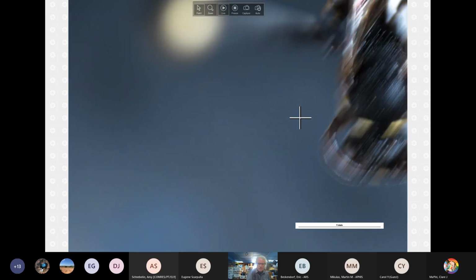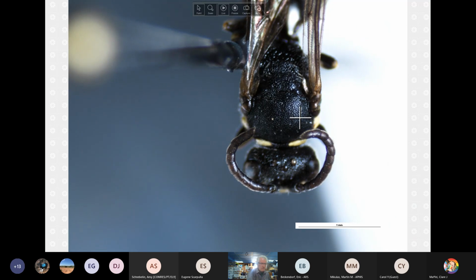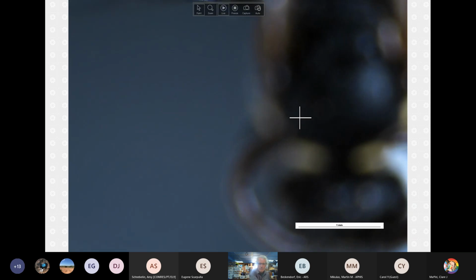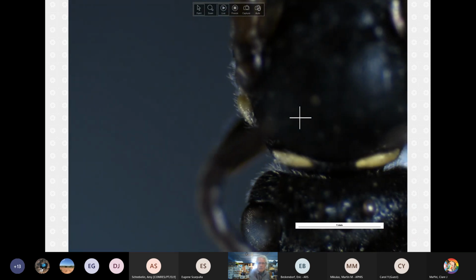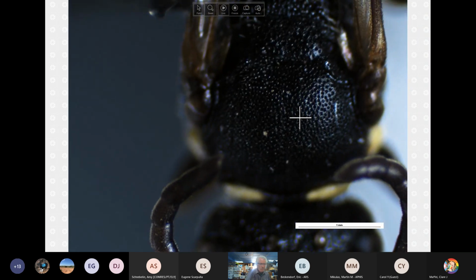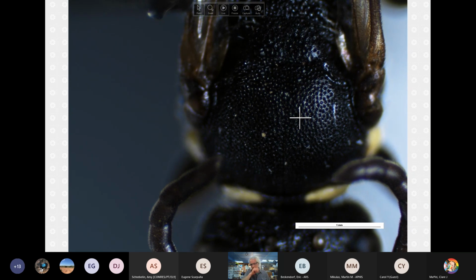And so this is where our ability now to get the lighting right really helps out. So we're going to go all the way up. And what I want to show you is what I tried to show in the females, but because the lighting was not very well received, I think, I'm going to jump back and change the lighting.